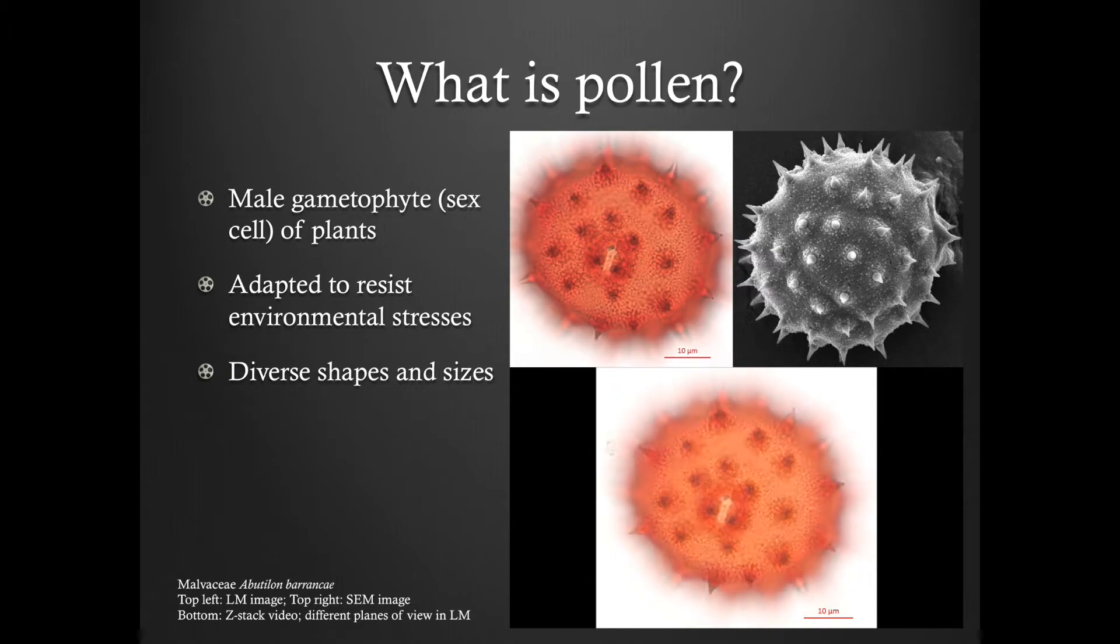A Z-Stack video is composed of approximately 100 or more images of a pollen grain at varying planes of focus combined to provide a 3D representation of the grain. This gives the user the ability to look at the pollen grain as if they were looking at it through a microscope.